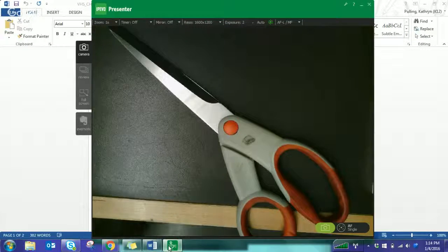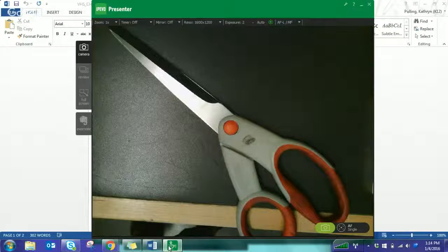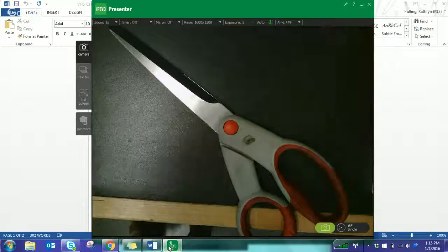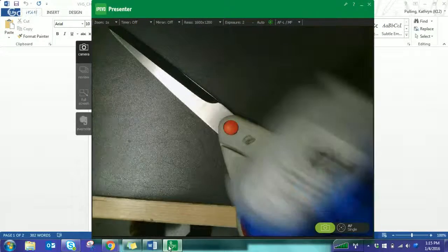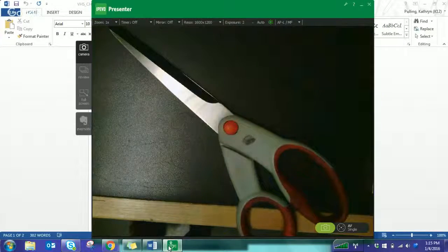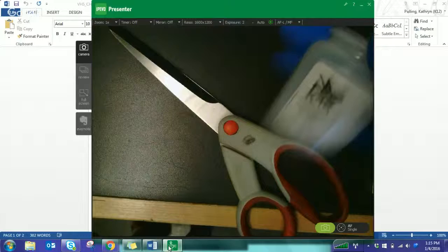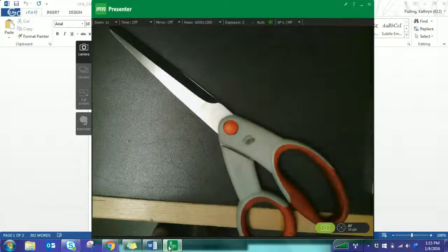And then there are 2 solids that you need for the first part of this lab. The first one is called alum, A-L-U-M. It's essentially aluminum. Okay. It's aluminum sulfate and something. All right. And then the magnesium sulfate, right there. Alrighty.